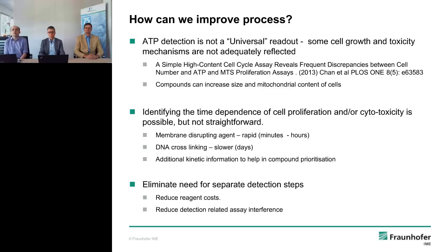So certainly in programs we've been involved with, having that additional kinetic information about when compounds affect cell growth and when compounds are cytotoxic is extremely useful in compound prioritization, along with the COMPARE type analysis where you have a putative description of the mechanism of action.